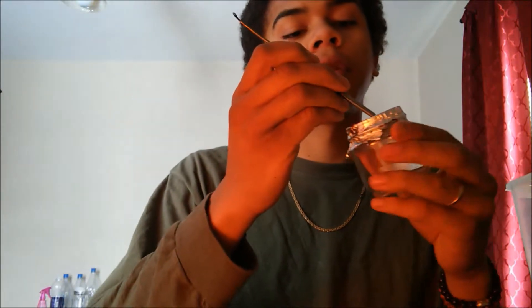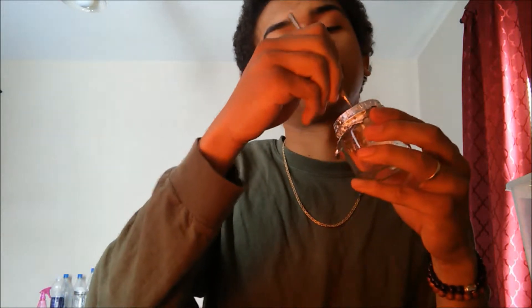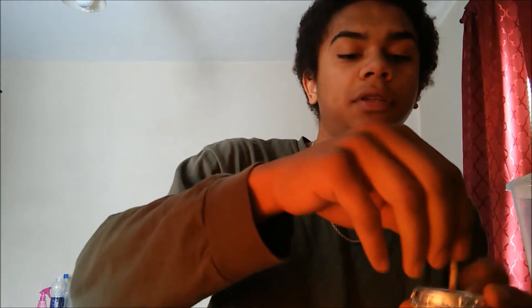We're going to take our little tool here and poke through the hole, and then we're going to just slide our wick through. All right, so our wick is through.